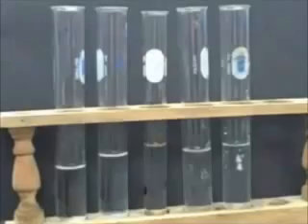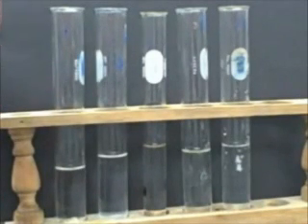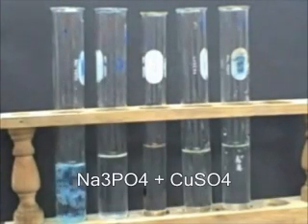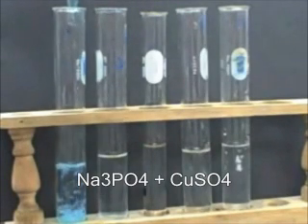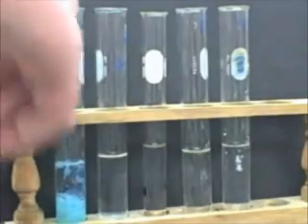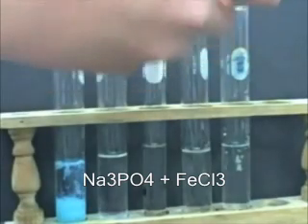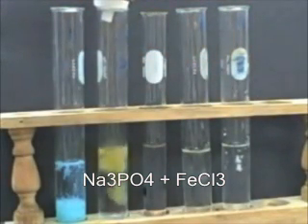Now we have 5 solutions of sodium phosphate. The phosphate ion is generally insoluble, so when we add our copper sulfate, it interacts with the sodium phosphate to result in copper phosphate, an insoluble product. So the copper phosphate is what's formed there. When we add the iron chloride to the sodium phosphate solution, the result is iron phosphate forming.